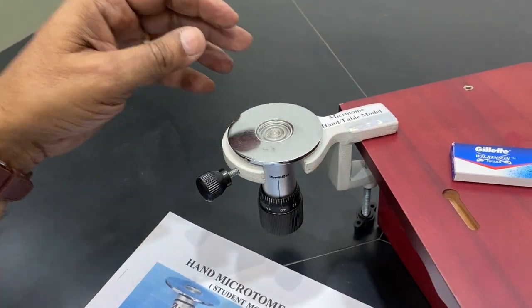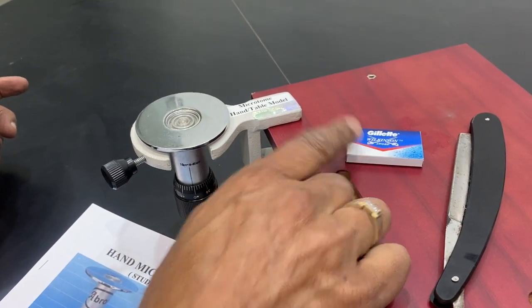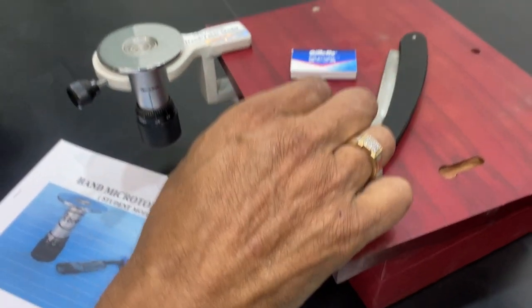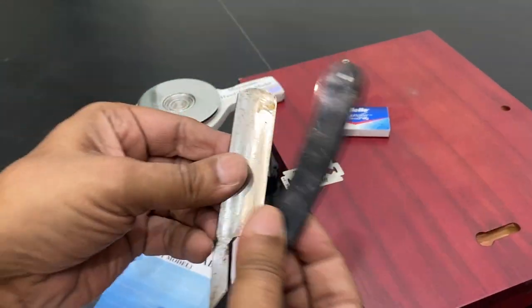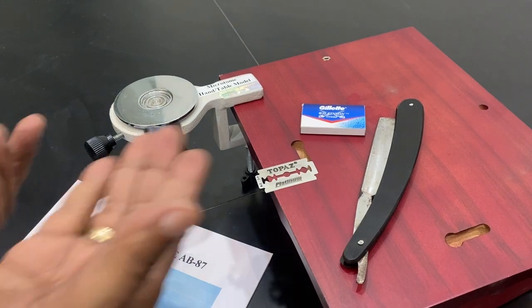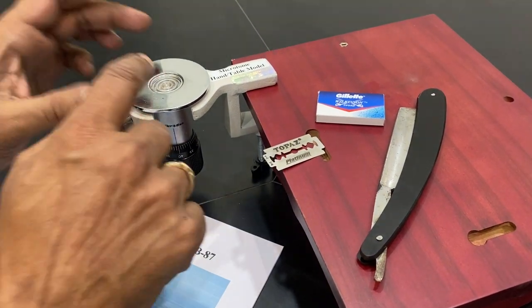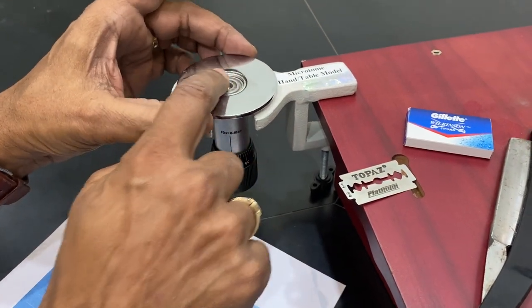You take a sample and it comes with a standard part — one blade packet. You can use your own blade, which you can open like this. This is the knife which is generally supplied, but it is better to use a fresh blade every time. Take a sample, make a block and keep it on the block holder.